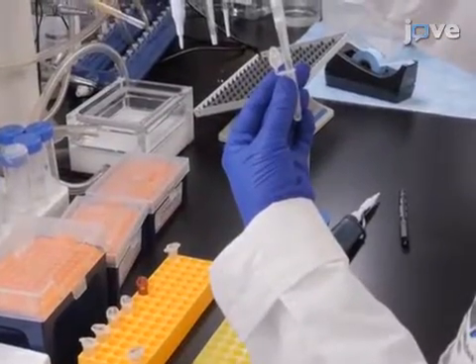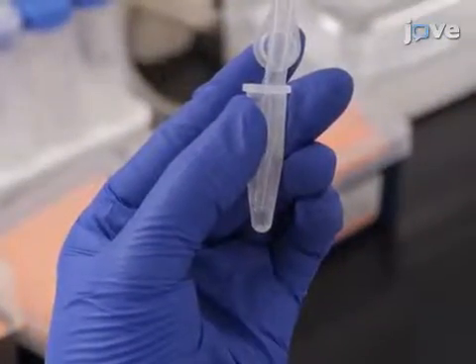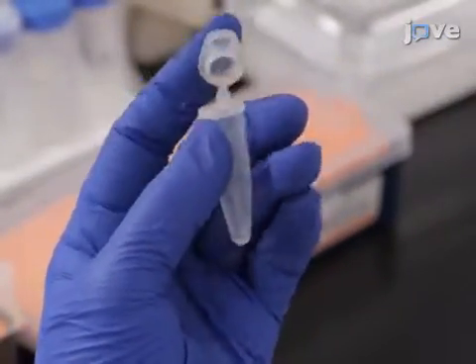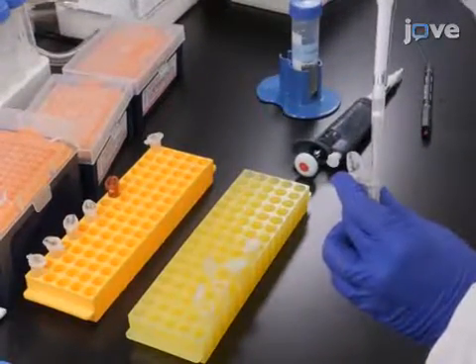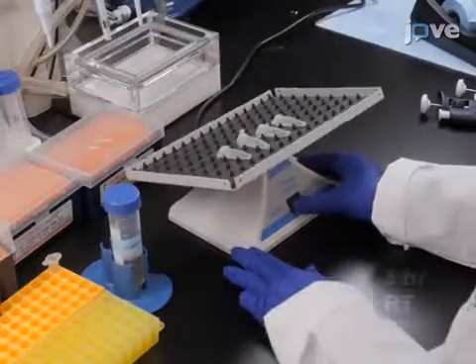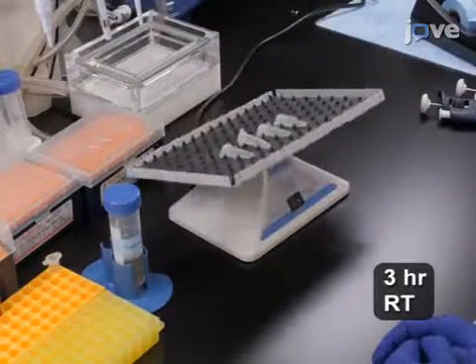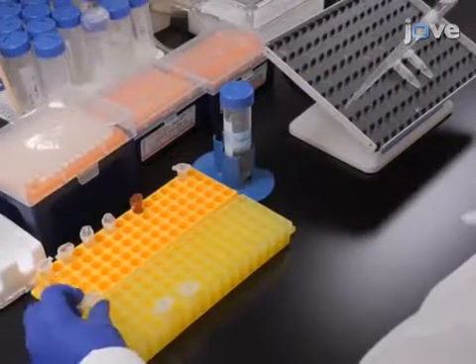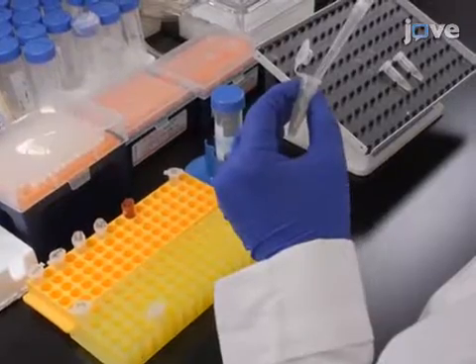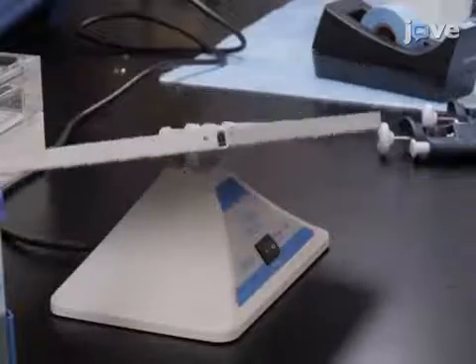To begin labeling, aspirate the medium from the tubes containing the ovaries, ensuring the tissue remains immersed under the solution throughout, and replace it with 500 microliters of medium containing 7 micromolar aphidicolin, a nuclear DNA synthesis blocking agent. Incubate the ovaries for 3 hours at room temperature on a benchtop rocker with gentle rotation. If drug treatment is desired, add the appropriate concentration of the chosen drug into the medium after 2 hours of incubation, and then allow the incubation to proceed for the desired time length for the selected drug.